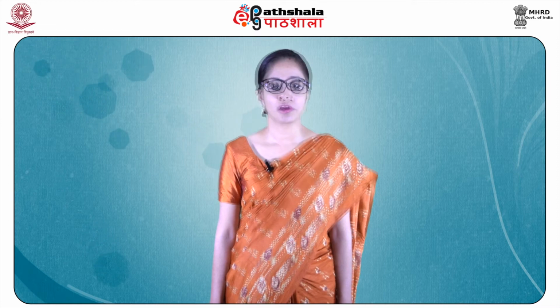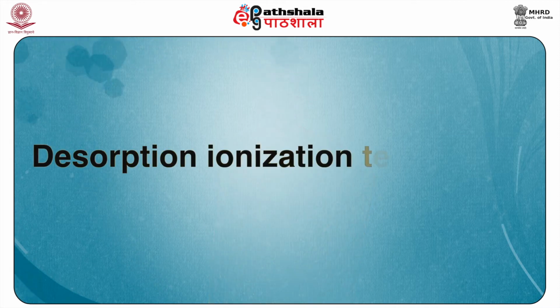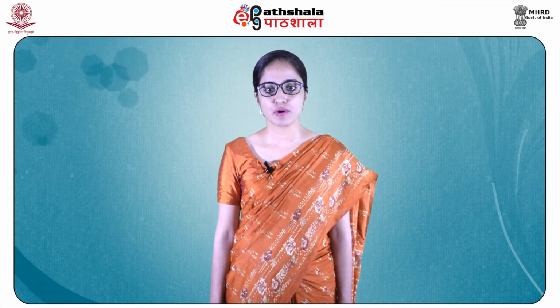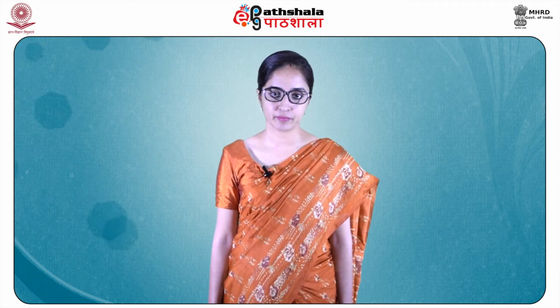We shall now come on to some very important ionization techniques which form a group, also known as the desorption ionization techniques. Now, let me tell you which techniques fall under desorption ionization. First of all is fast atom bombardment, also short-formed as FAB.